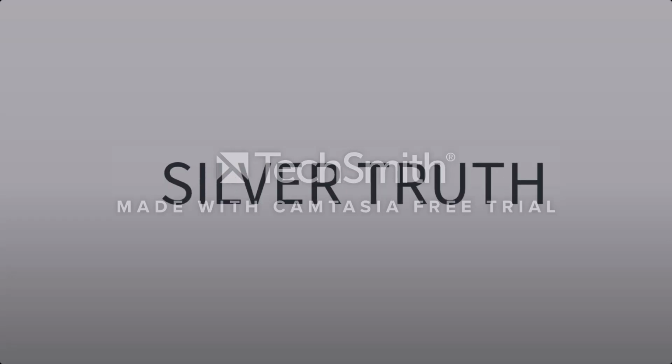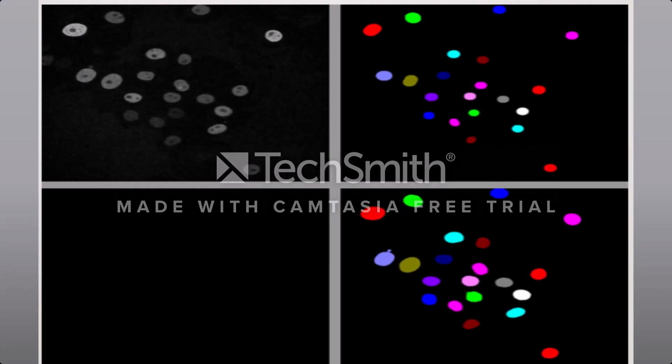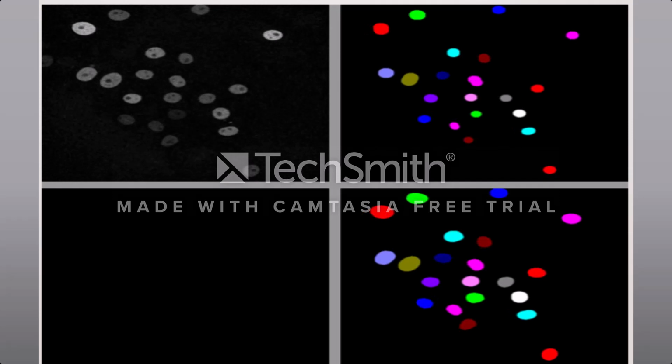The resulting categories would then be ground truth, which contain the exact reference annotations, gold truth containing human-made annotations, and the silver truth containing computer-generated annotations. For instance, in this image, we can see a real image of captured cells and its corresponding annotations.